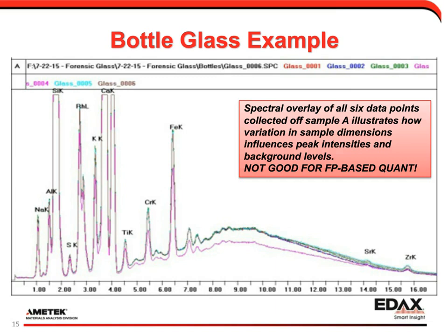So that would, in my mind, qualify to then take this one step further and actually use the quantitative procedure in the guideline, because as the guideline states, if the overlay showed samples that had vastly and clearly different compositions, just visible from a peak overlay, you could conclude that they are different in composition.